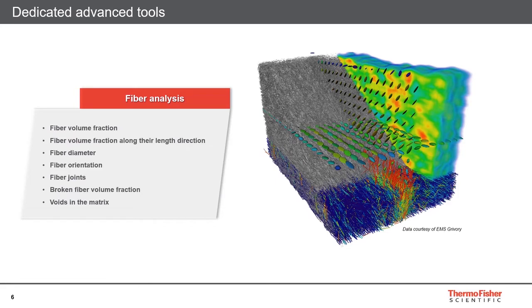Avizo Software provides dedicated tools to allow you to better visualize, analyze, and obtain actionable results from your image-based data. Avizo Software has advanced fiber analysis capabilities. You can easily apply automatic segmentation of your individual high-resolution fibers to know the major orientations of your low-resolution fibers. You can apply quantification, such as contact point or distance to closest neighbor. You can also obtain fiber shape statistics, such as diameter, length, tortuosity, area, volume fraction, or cross-section perimeter.